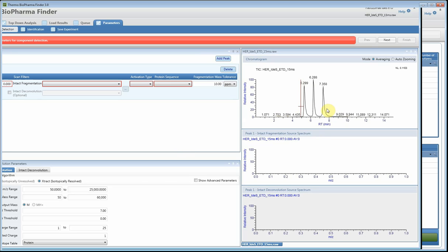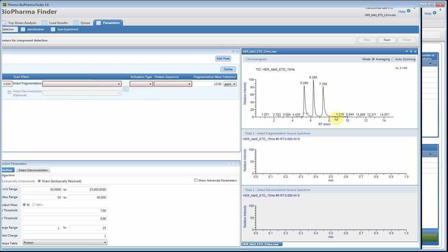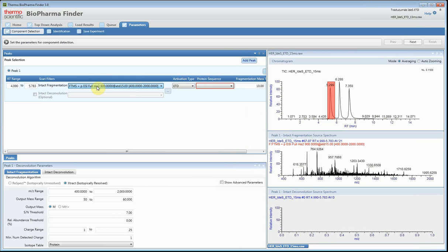For the IDES digest of trastuzumab, we know the first peak is the Fc, the middle peak is the light chain, and the third peak is the Fd. We're going to define that in the software. I like to do this by dragging across the chromatogram — make sure you're in the averaging mode. You can also type a specific time range in the red space. The software will show you the actual time range and read the scan headers within it.